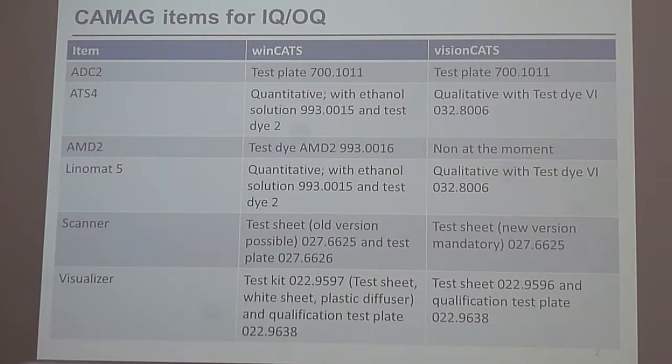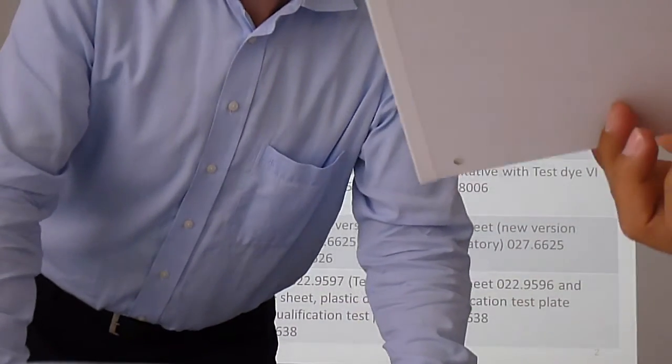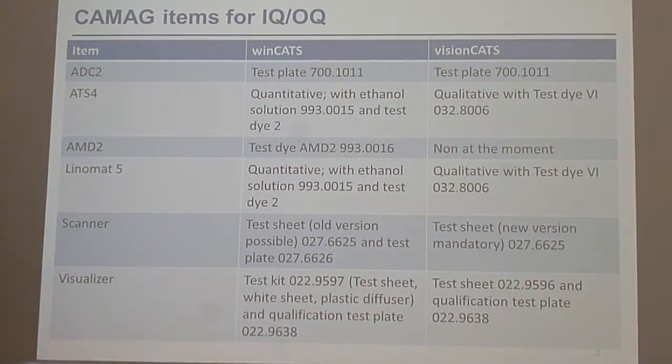One question. This is the version 3 for this code. That's just for us internally, this -3. So that's not the order number. Here you have the order number, and there it's a little, it's not that nice.